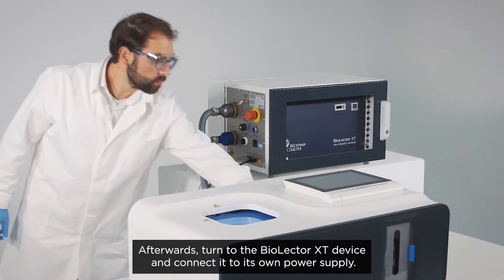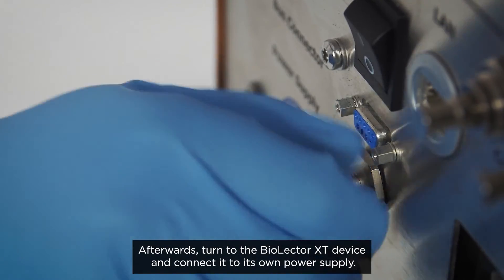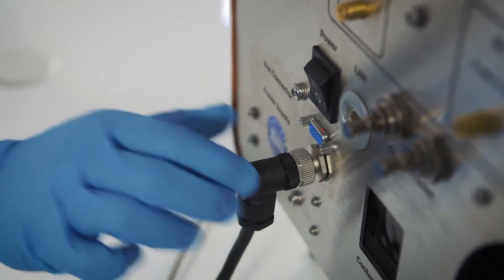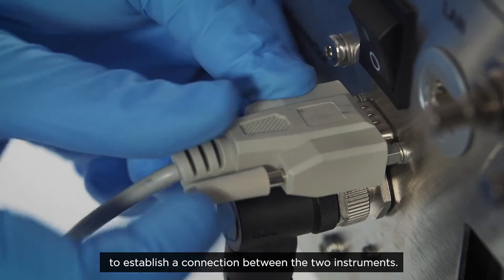Afterwards, turn to the BioLector XT device and connect it to its own power supply. Then connect the bus cable coming from the VCU to establish a connection between the two instruments.